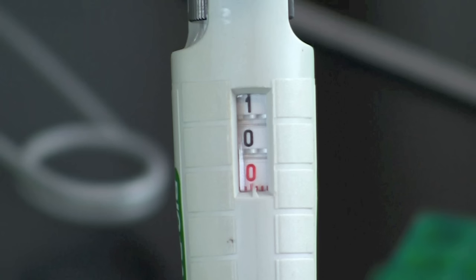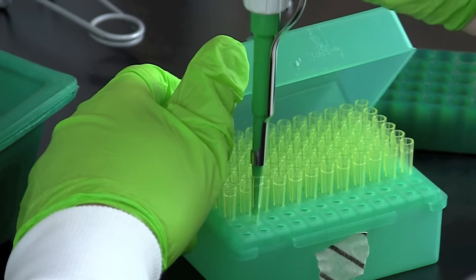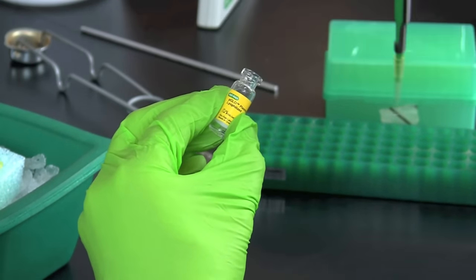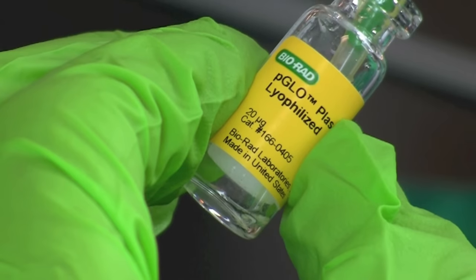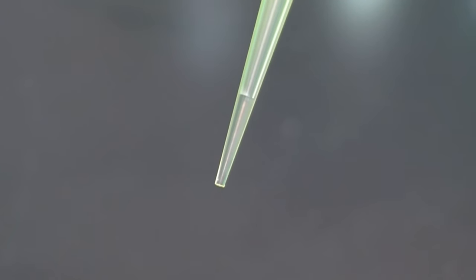Using a micropipette set to 10 microliters, obtain 10 microliters of pGLO plasmid. The volume of plasmid you will be working with is usually very small, so make certain you are looking directly into the sample as you pipette. You should also visually inspect your pipette tip to verify you have obtained 10 microliters of sample.